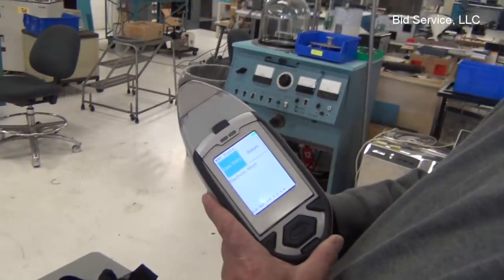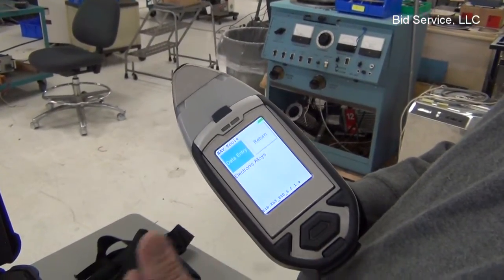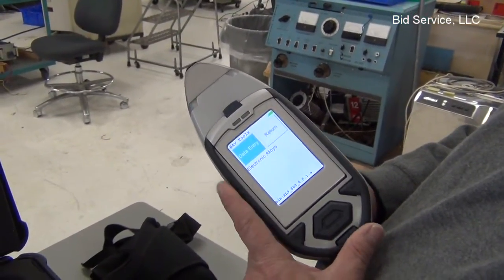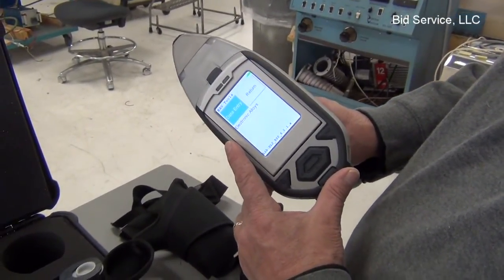I've set it up already. The password to get in is 1234, and it's also included in the paperwork that comes with it. I've already set it up to take an electronic alloy reading.